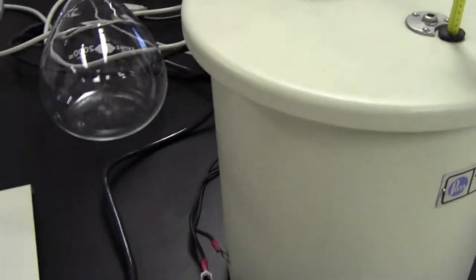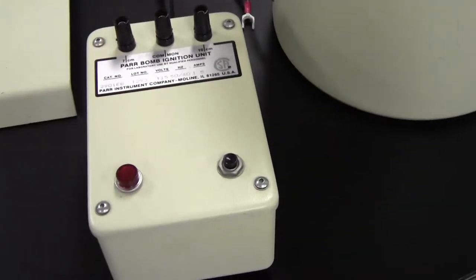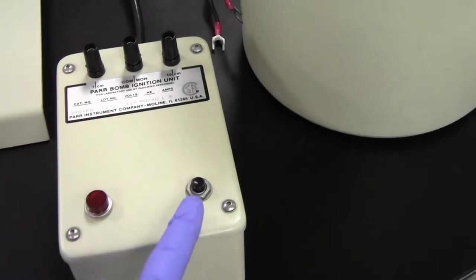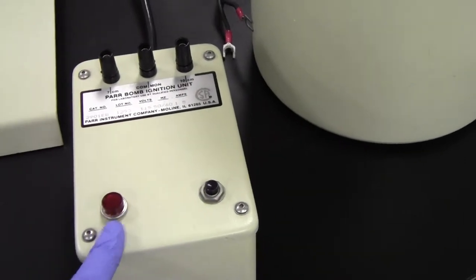You'll collect temperatures during this pre-period that will be stable, and when it's time to fire the bomb, you will do so by pressing this button on the fuse box. I won't do it now, but when you press it, this light will come on to show that it fired.